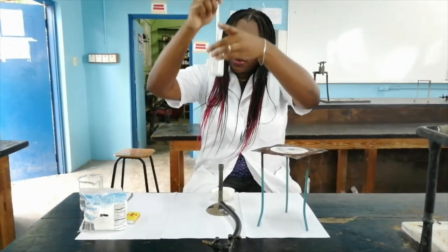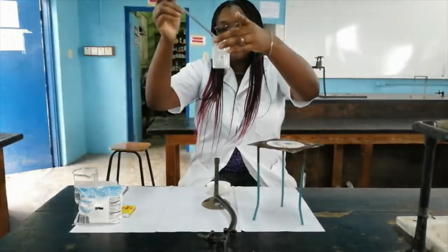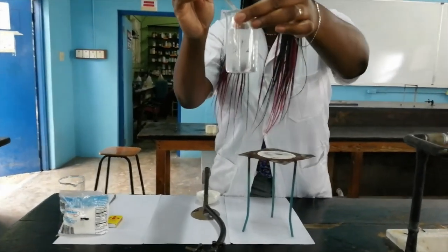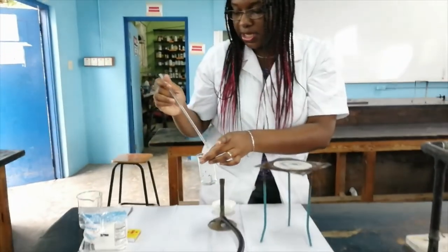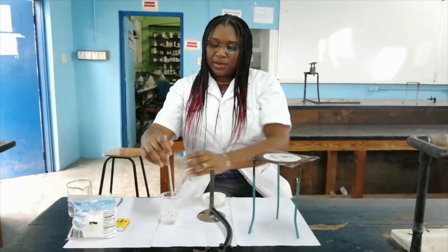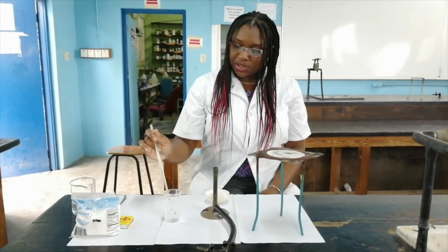So at the bottom I can see that I no longer have crystals there, so I know that my table salt has dissolved. And all those small bubbles that were in the solution — they're dispersing right now.